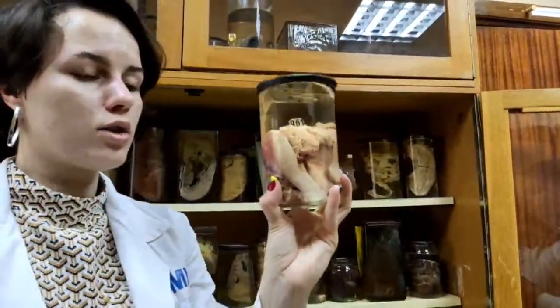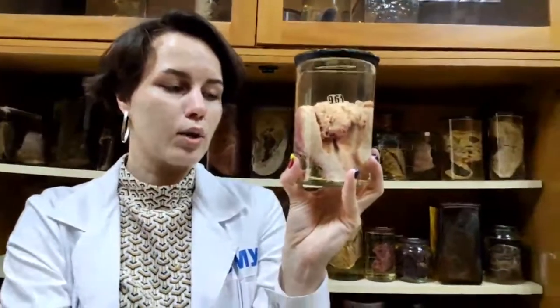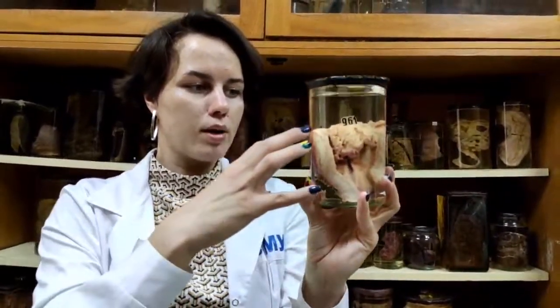It can be removed by doctors, but when it's a malignant tumor, that doesn't solve the problem really frequently, because this is a malignant tumor. That means that it grows into the wall also.